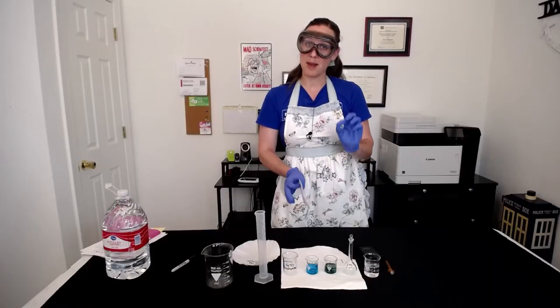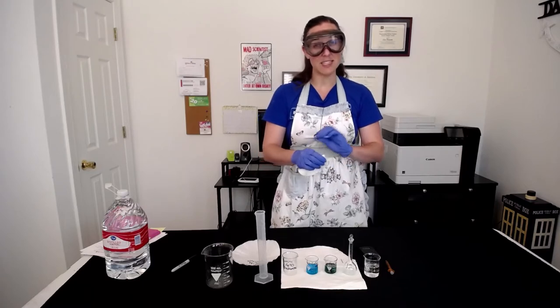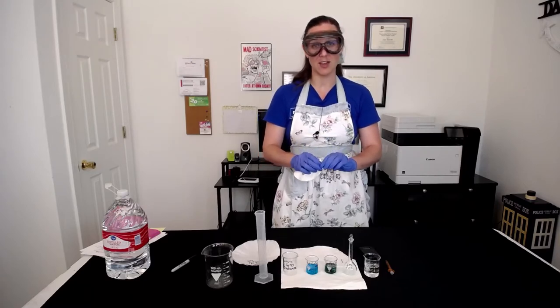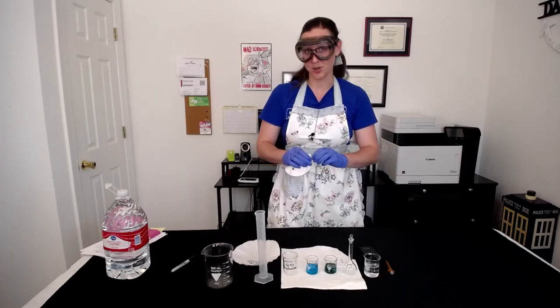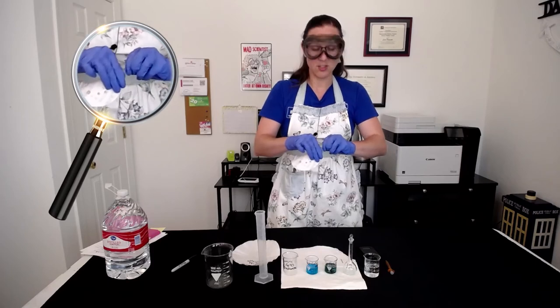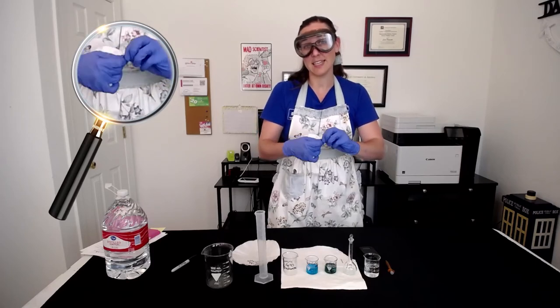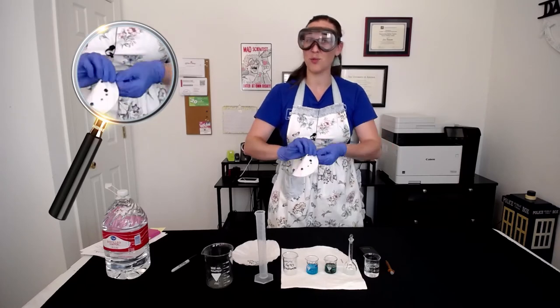The next thing we want to do is prep a nail. We're going to take an iron nail and some sandpaper and just sand off the exterior of the nail so we can really expose all of those iron atoms for the reaction to occur. Just sand it down a little bit till the nail is nice and shiny, till any imperfections on the outside are removed with the sandpaper.